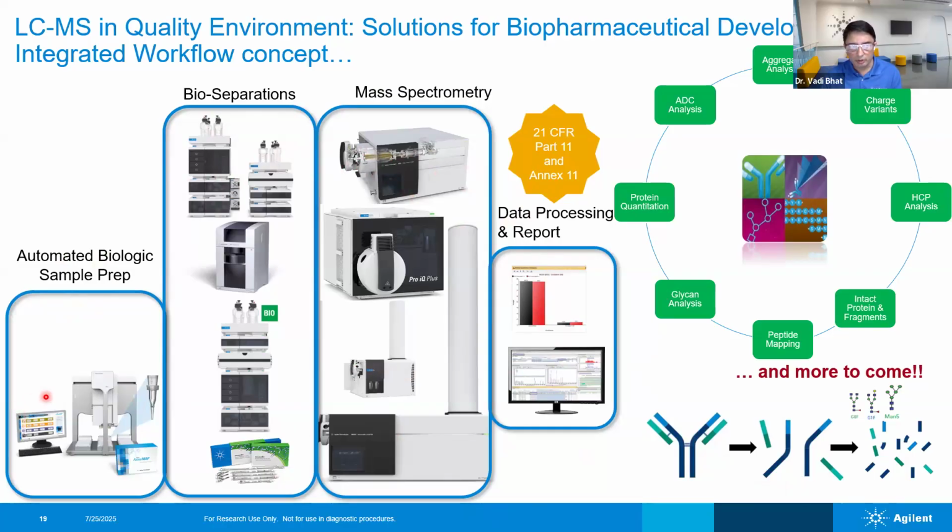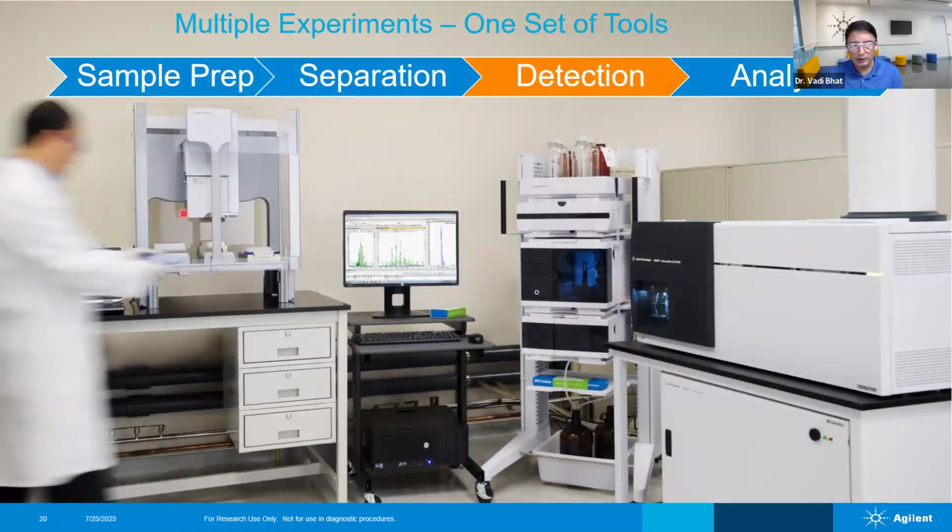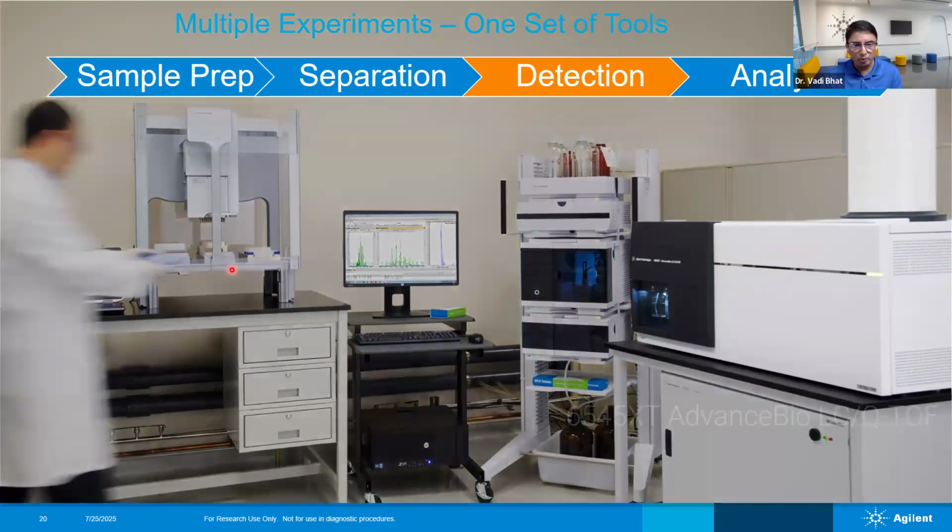For example, if you want to analyze a released glycan, you use an automation or kit-based approach, then separation, then analysis, and then reporting, right? So it's combined as a workflow like this. On the right side, I show in the green squares the various types of workflows we generally talk about. A typical mass spectrometry lab looks like this: your mass spec and separation techniques, and of course sample preparation, any kinds of automation, or typical sample preparation methods.